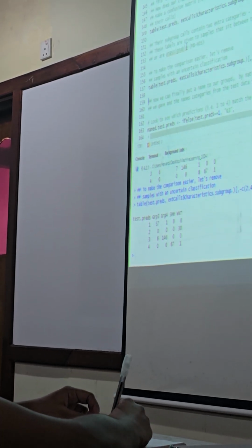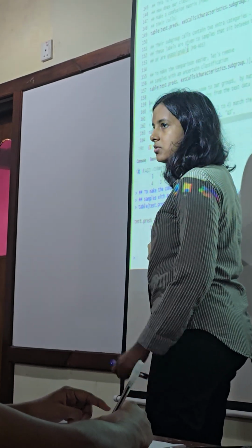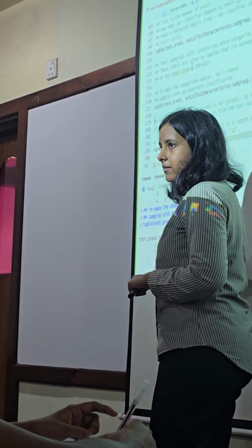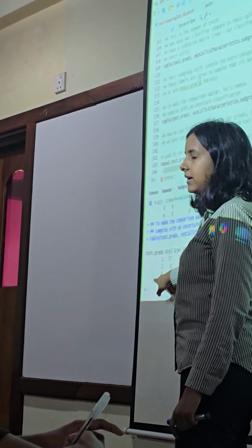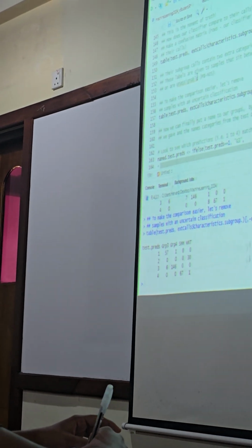So now, if this group is SHH, you check in DAVID. So you have the DAVID results. You check whether the SHH pathway was enriched there. Right? So this is where you assign the names to your groups. So it should reflect in the functional annotations as well.